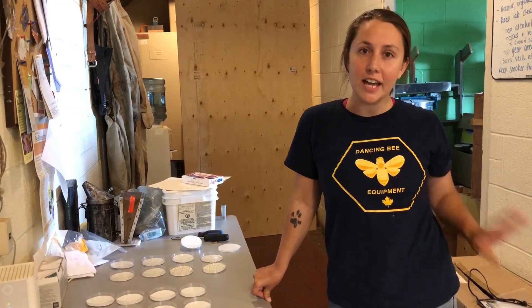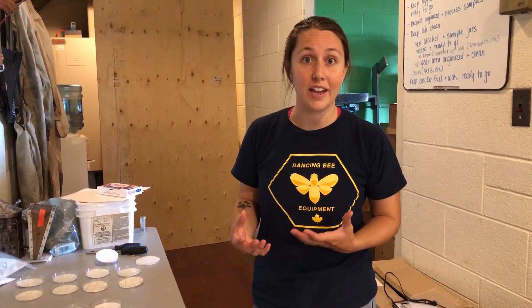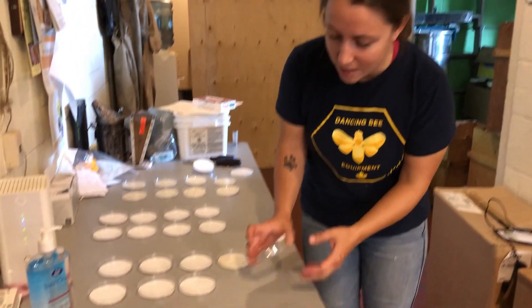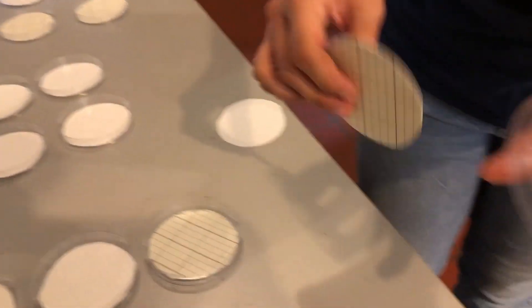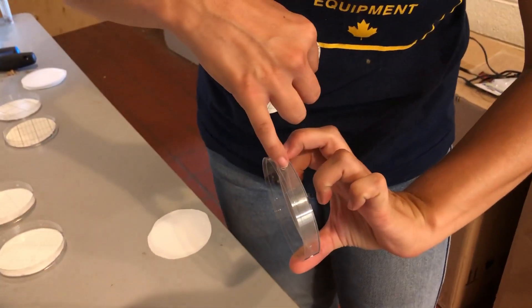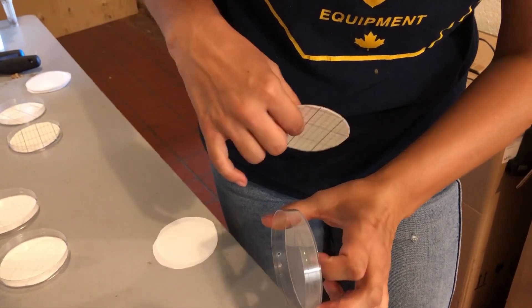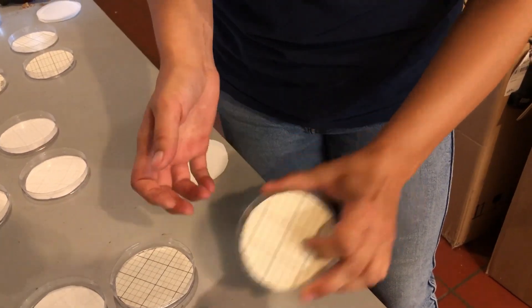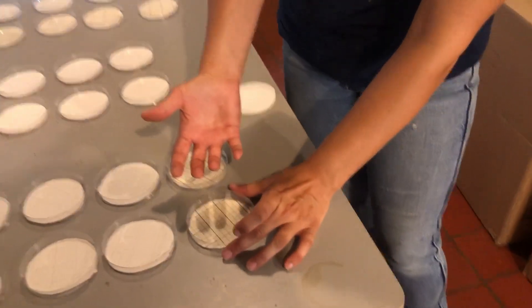Now that we have our bees, we've got them back in the office and we want to let them sit and be exposed to that chemical for 24 hours. During that time, we want to collect the mites that are dying after being exposed to that chemical. So we're going to set up our jars on top of little sticky boards. We've got a petri dish here — we've drilled holes in the side for ventilation — and then we've cut out little circles that are sticky that are going to collect the mites that fall down.